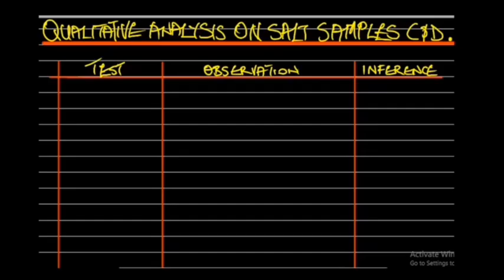Today we quickly want to take a look at the samples that NECO has released for this year's qualitative analysis examination. We have two samples, sample C and sample D. We'll quickly look at both of them, and then we'll talk about possible tests that we could come across. So let's start with the first sample, sample C. What are we to expect if we come across sample C?